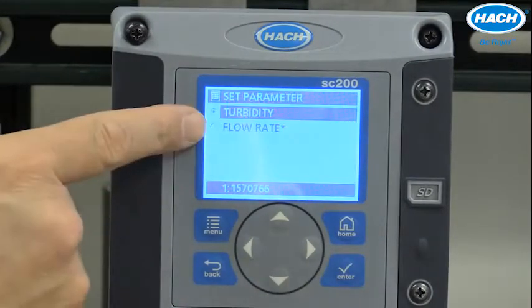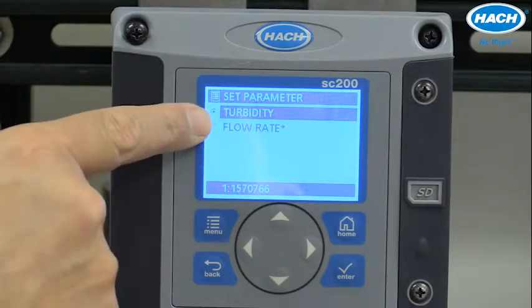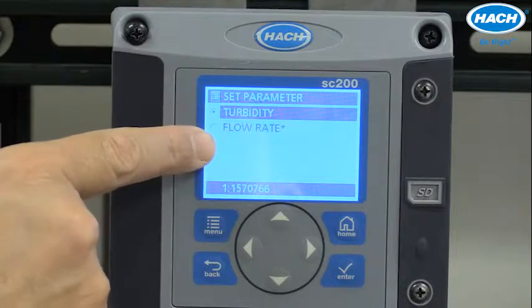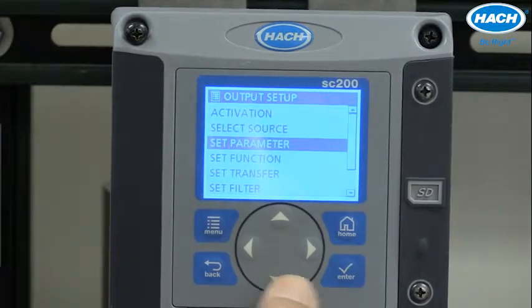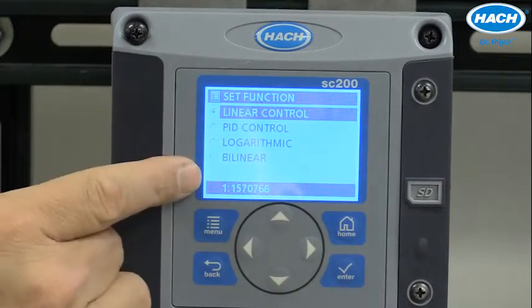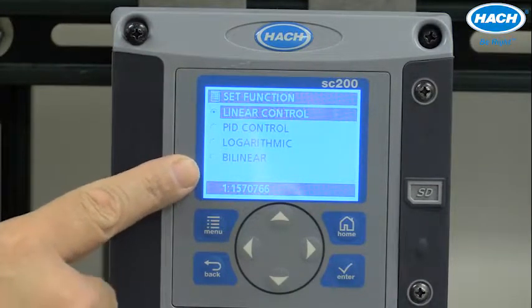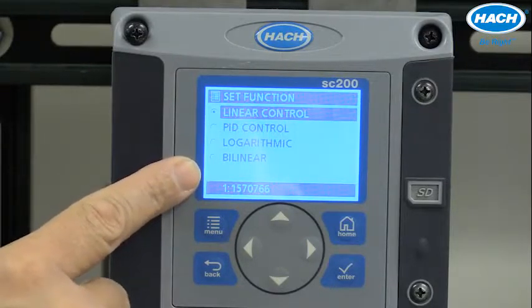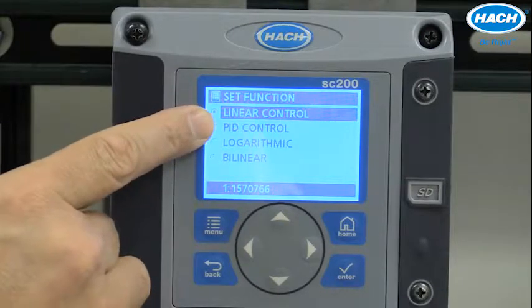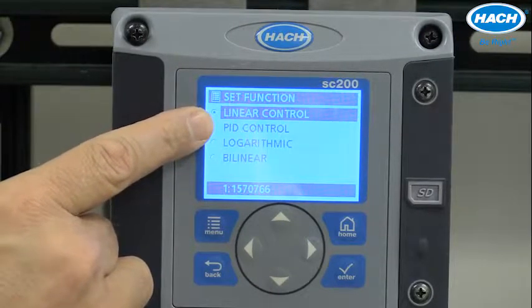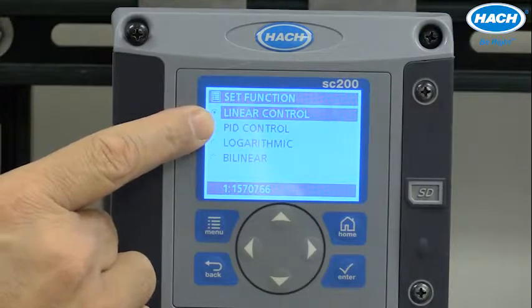The parameter depends upon the sensor, and for the 5300 we have both the turbidity value or the flow rate. In this case, we'll use the turbidity value. Function provides four different ways that the analog output will monitor or reflect the turbidity value. Most all cases will use the linear control, in which every turbidity value will end up with a proportional current in a linear fashion.